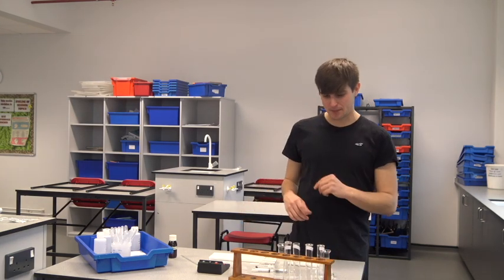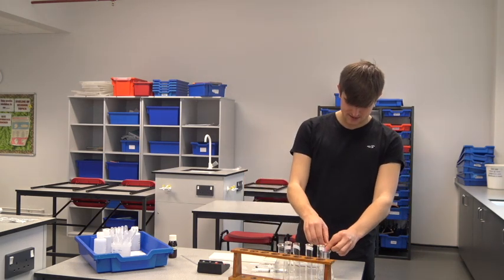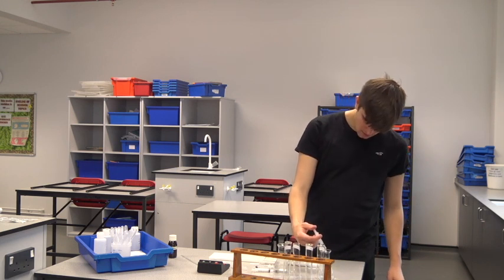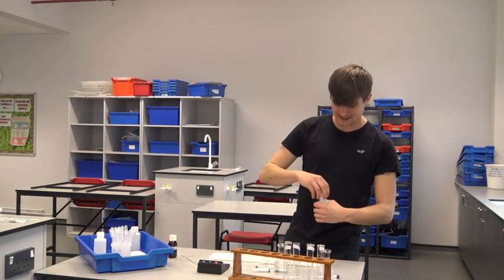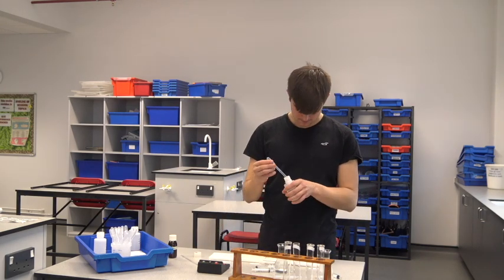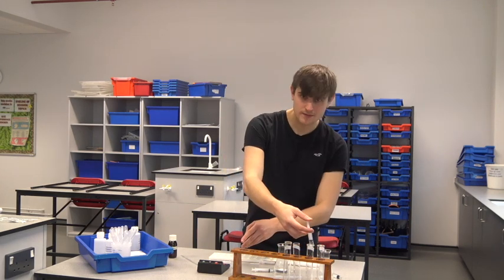Let's make our pH 5 solution. We're going to make it exactly the same way — two centimetres cubed of my amylase goes in. It's important that I add the buffer next, because as soon as I start adding the starch, the amylase will start breaking it down.